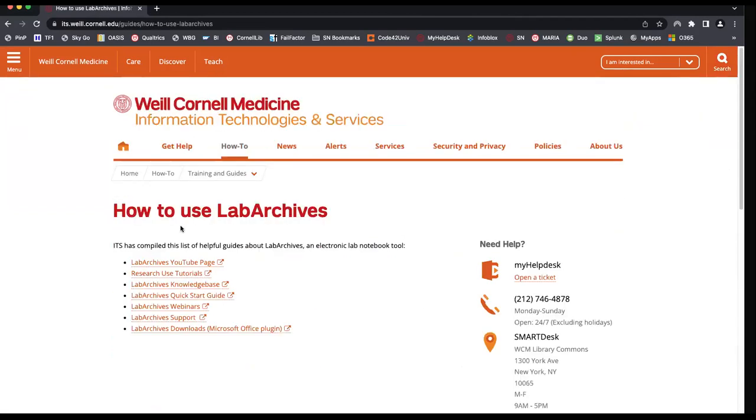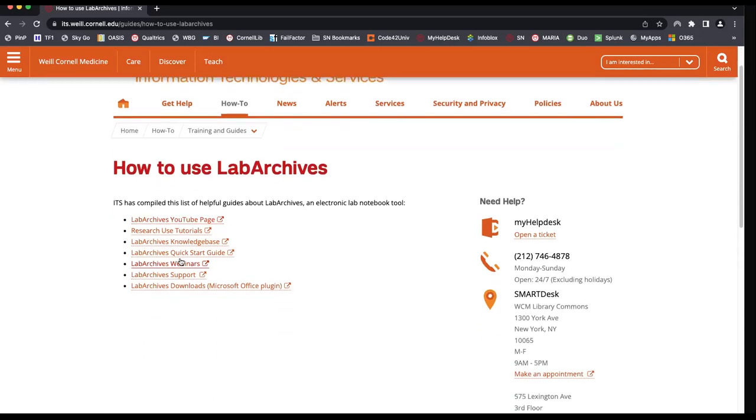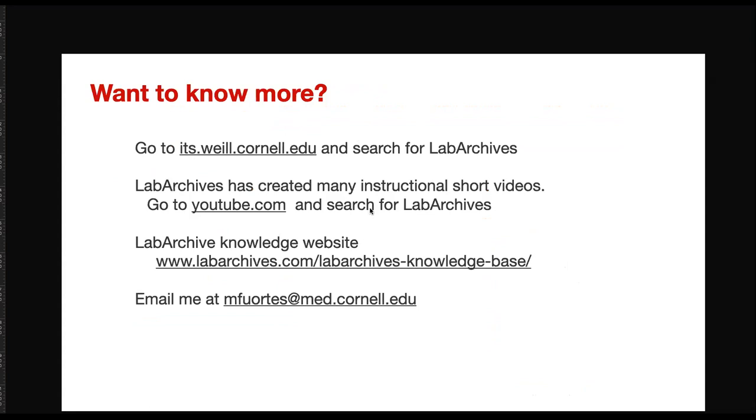Okay, click on use LabArchives. LabArchives have their own YouTube page. They're very nice short movies. The database, the quick start guide. You can log in for seminars. You can find LabArchives support. You can download things. So there are a lot of ways to get information.